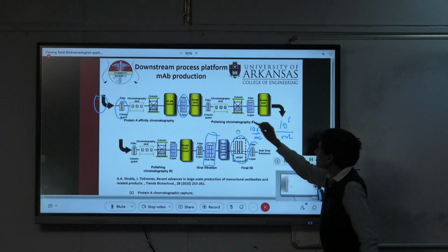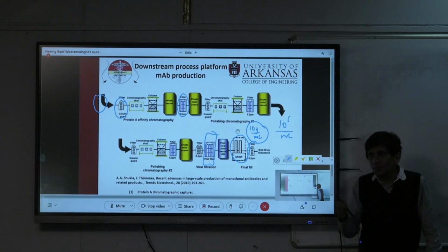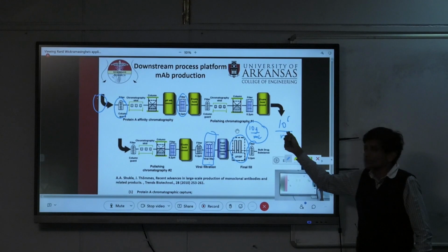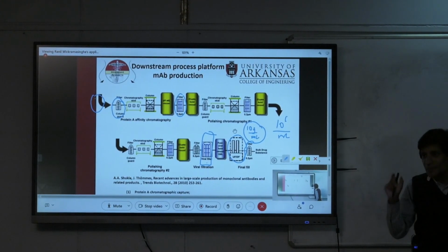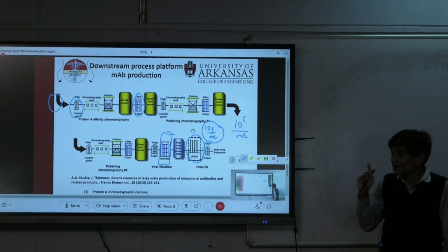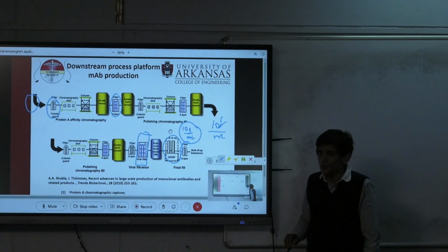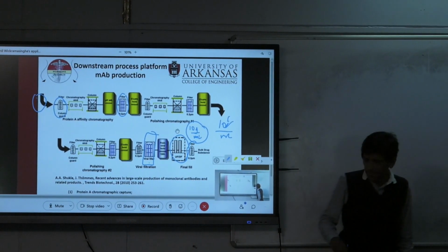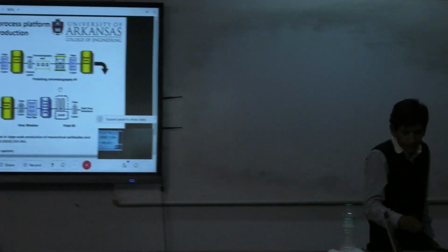It can be quite high, but you will convert that, if you knew the molecular weight of your protein, into a number. You will find that it's huge compared to this. Okay, it's certainly less than 1 molar, but it's huge. Remember 1 mole is 10 to the 23, so it's huge. So there's no way that this could lead to fouling. The numbers are too small. Okay. So let's continue.